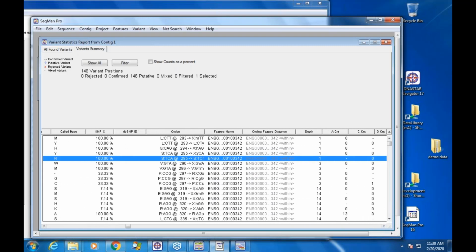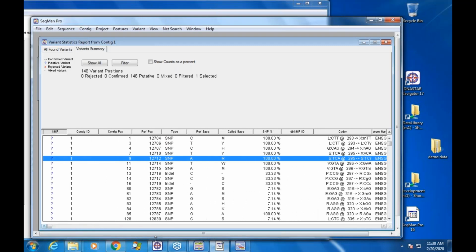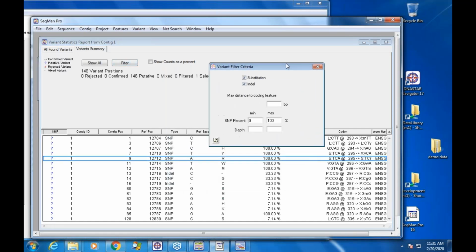You know, there is a codon change there, but it's a pretty basic kind of variant report. And this is really our original variant report that we designed back in around the year 2000. So it was kind of home-brewed. We use nomenclature that isn't necessarily standard. So this is pretty outdated in terms of what it's displaying. There's a filter here, very basic filtering.